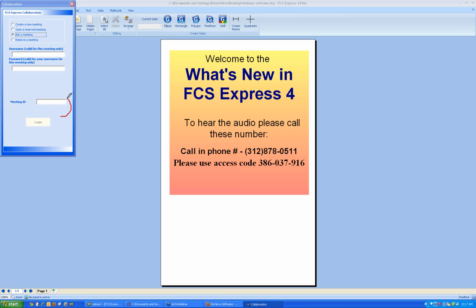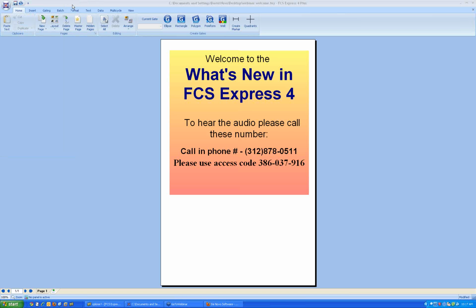You can control other people's mouse with their permission, of course. You can transfer files to them. Anybody can show their screen. So it's a really, really powerful way of people collaborating and working together using FCS Express. So we will have a webinar on that a little bit later, just going through how to use the collaboration tool, but it's very, very easy, and it's all explained in our manual.